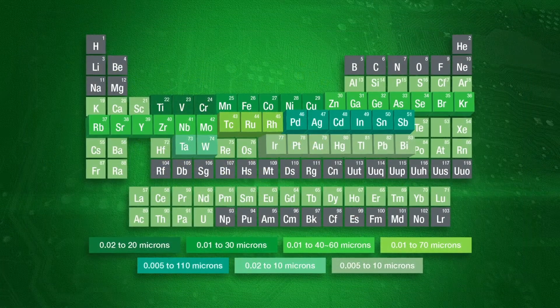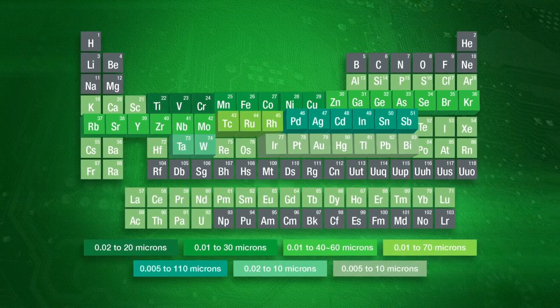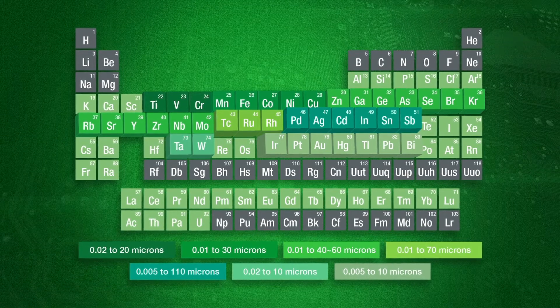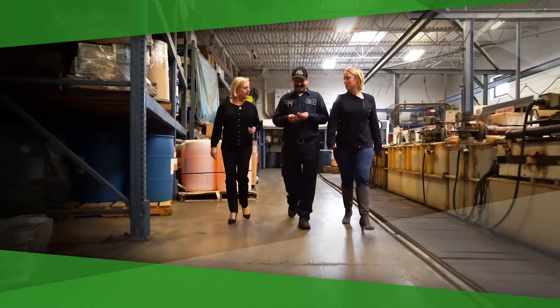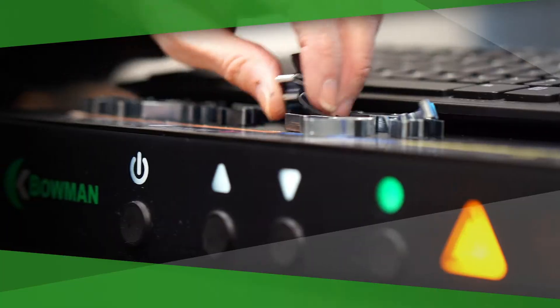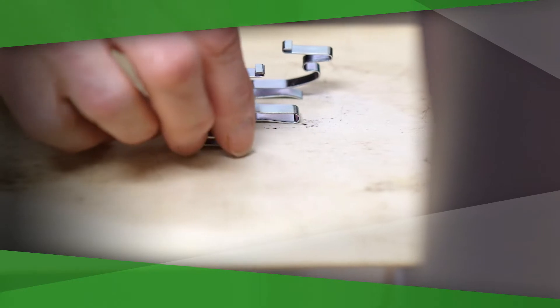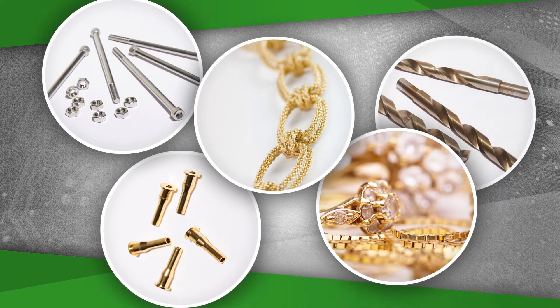Like all Bowman instruments, the G-Series performs composition analysis from aluminum 13 to uranium 92. Twenty-five elements can be measured simultaneously. It is ideal for labs and production lines that need to position samples quickly and for environments where benchtop space is limited. Major applications include fasteners, gold jewelry, and hardware.